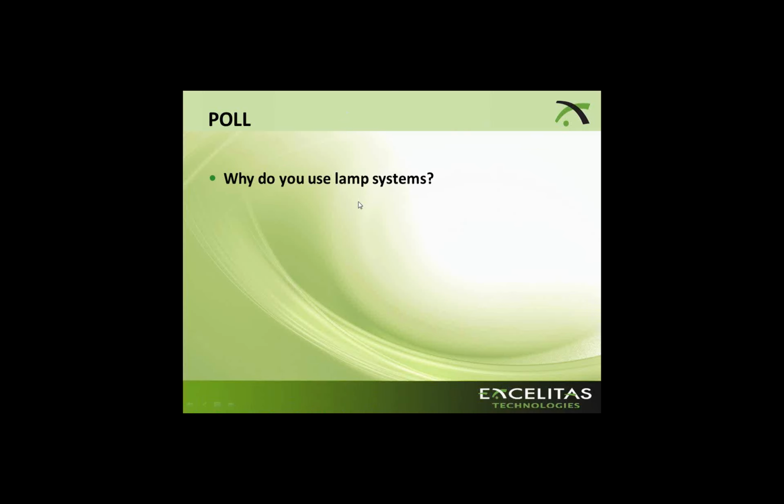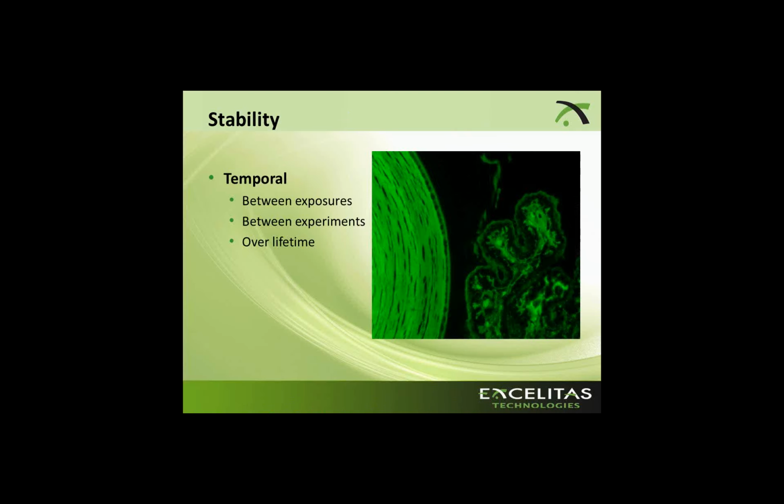And if I have an experiment now and I go away and incubate for 2 hours to come back and take another picture, my control is the same, hopefully, between the 2 hours, but I don't know whether my lamp has degraded or something weird has happened within those 2 hours, or for that matter with the LED. And that's something you should bear in mind when you're conducting your experiments.